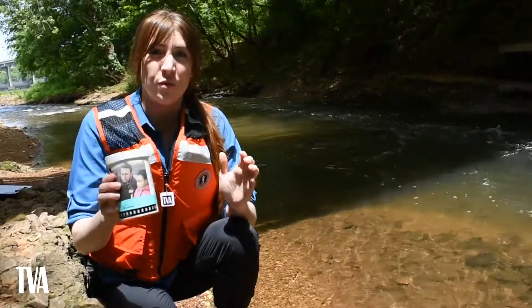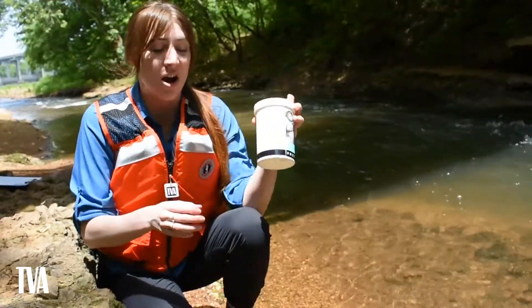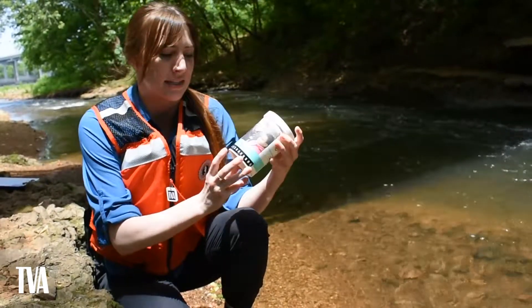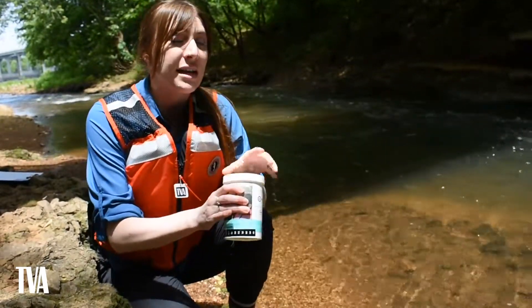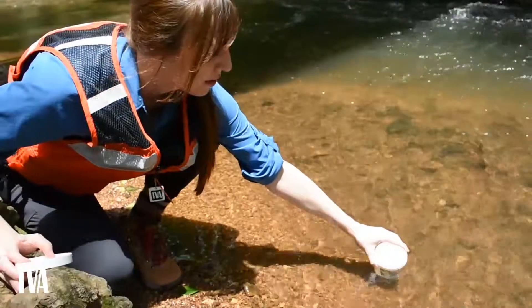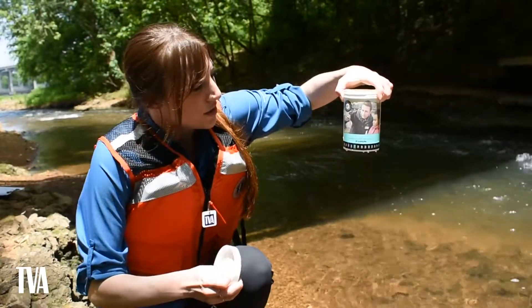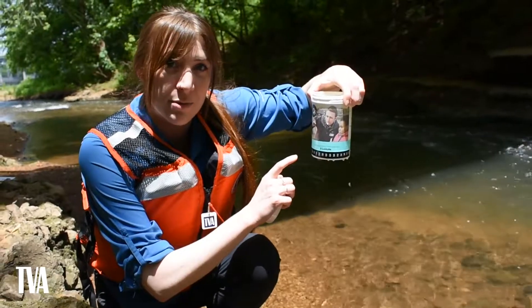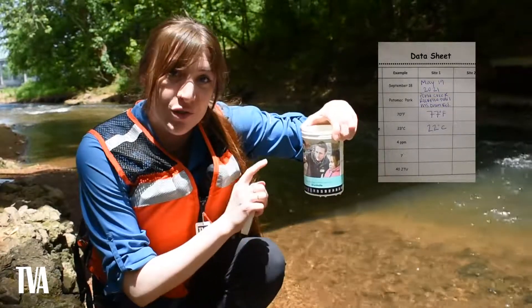The first test we're going to do is water temperature. You need the beaker — take the lid off. This black strip is our thermometer, recorded in degrees Celsius. Right now it's recording air temperature, but we're going to hold it under the water completely submerged for 30 seconds — that's 30 Mississippis. Then we'll check the water temperature. The brightest lit number, usually green, is the accurate water temperature. Record that number on your data sheet in degrees Celsius.